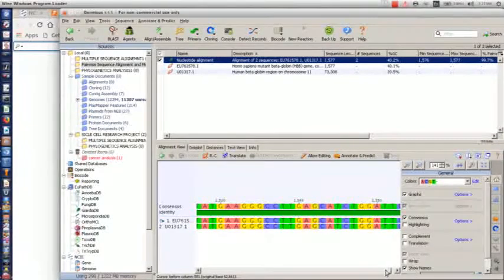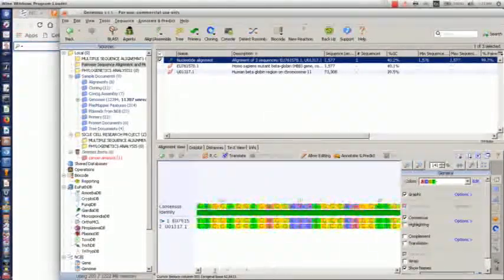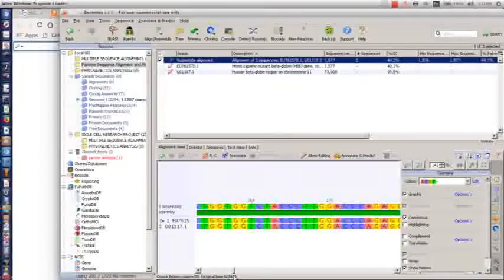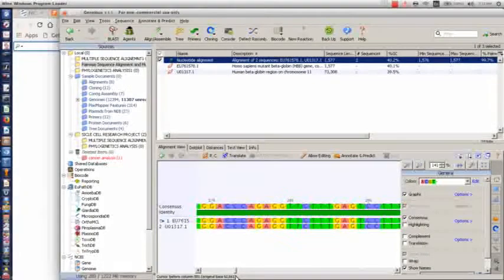Now we want to understand the effect of those mutations on each amino acid: the effect of the mutation on the bases in the codons, and then the effect of the codon changes on the amino acids. So we have just passed through the nucleotide mutations here.